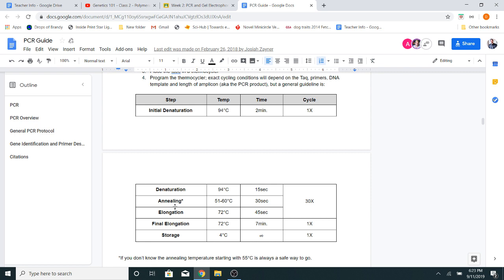So it's been really hot, all your DNA separated, it all came back together, your primers annealed, you gave them a little time. And so about half your primers are stuck, or a little bit more than half, because generally your annealing temperature is, depending on the polymerase, about 3 to 5 degrees below the TM, the melting temperature that's calculated. Though some polymerases actually want you to go above that because, at least theoretically, they stabilize the primer on the template. So look at your polymerase, because they have instructions for whether you should go above or below or how many degrees. Usually those are pretty accurate guides. But for Taq, it's 3 to 5 degrees Celsius below the TM.